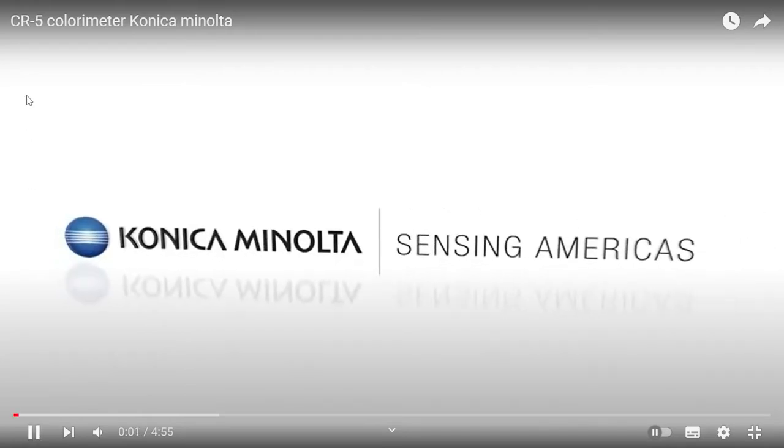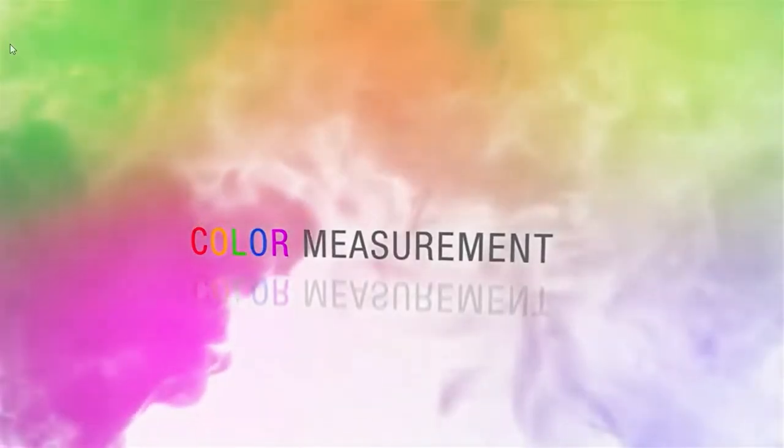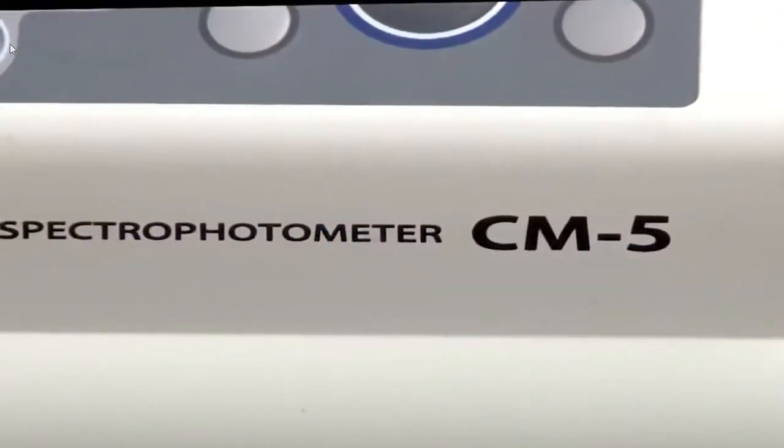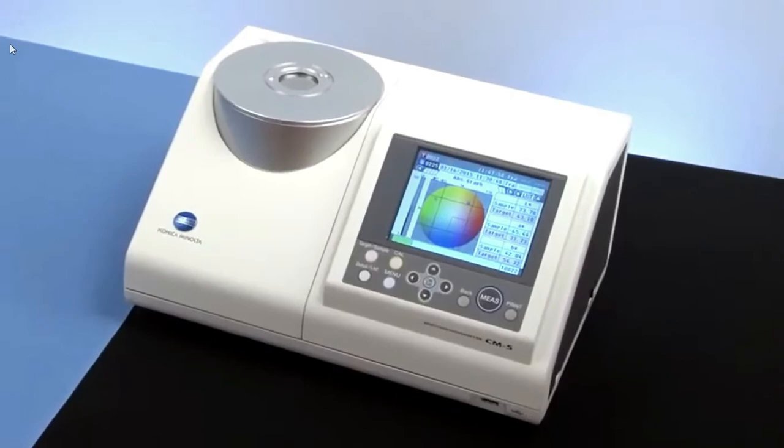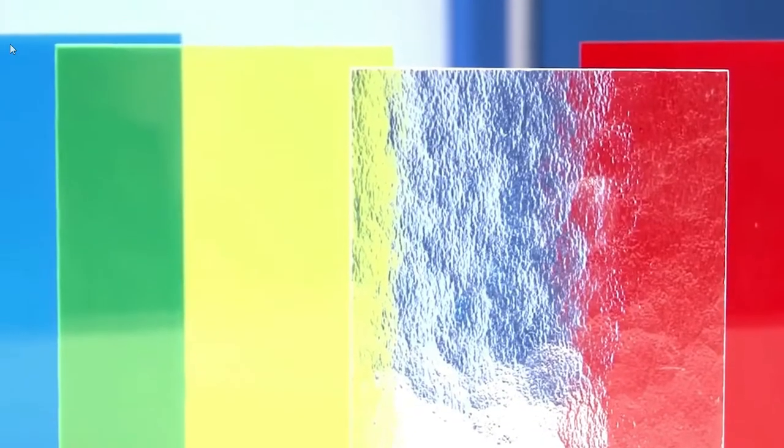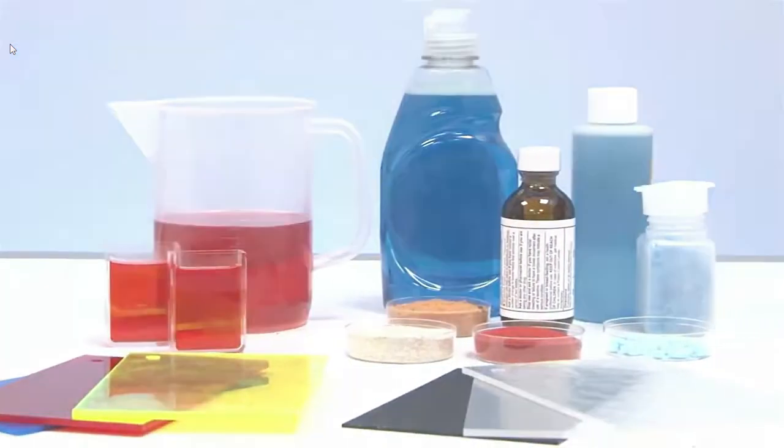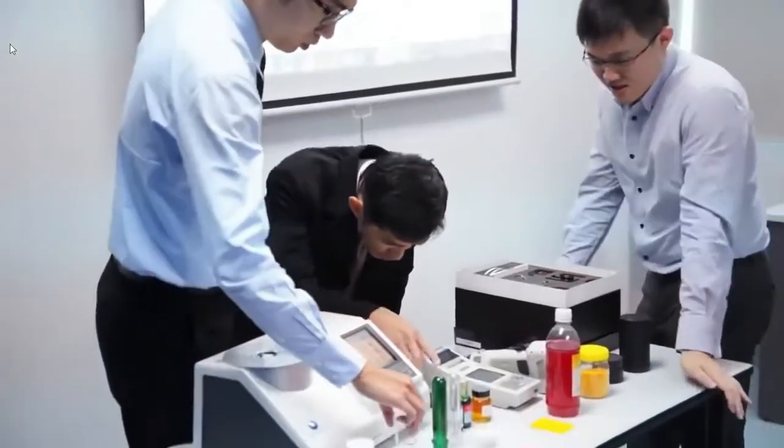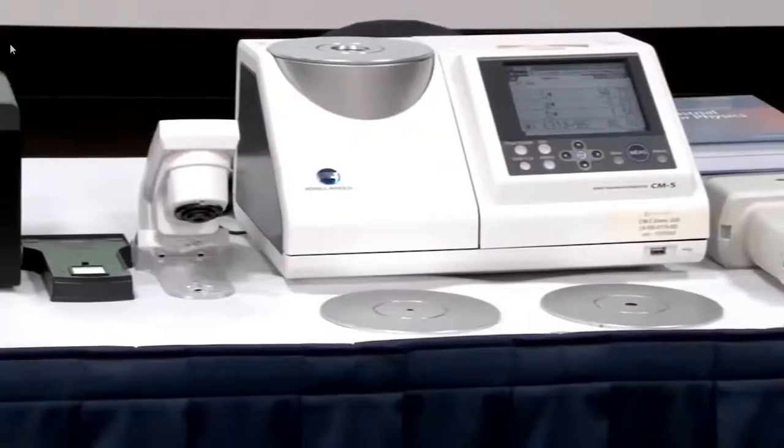Konica Minolta Sensing, the leading manufacturer of color measurement instruments, offers the CM5 benchtop spectrophotometer, a vital tool in research and development, quality assurance, and laboratory testing. Used by top companies all over the world, the CM5 takes the guesswork out of color evaluation.